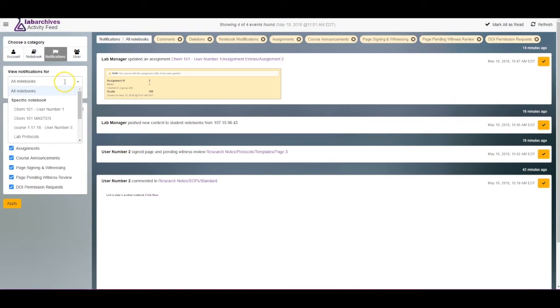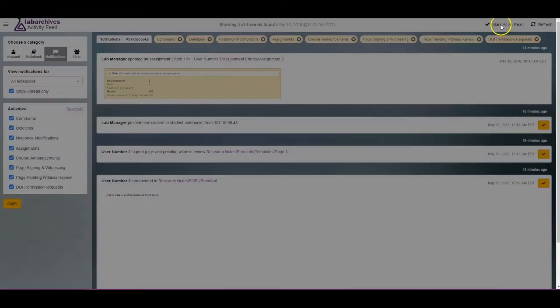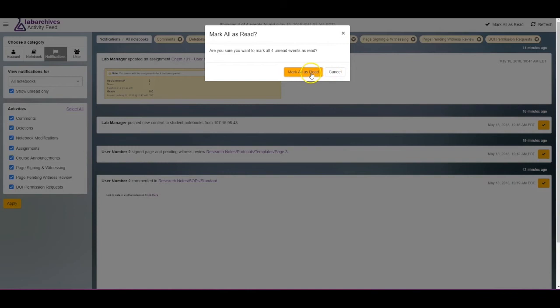To mark a notification as read, click the checkmark on the right side, and to mark all notifications as read, click Mark all as read at the top right.